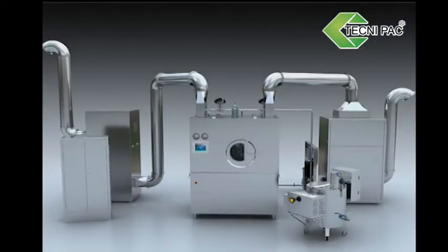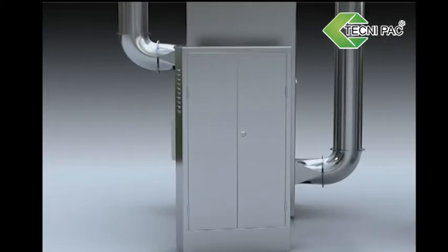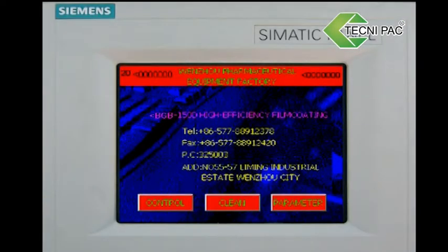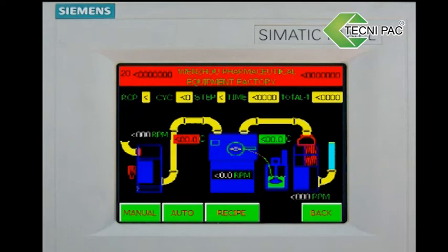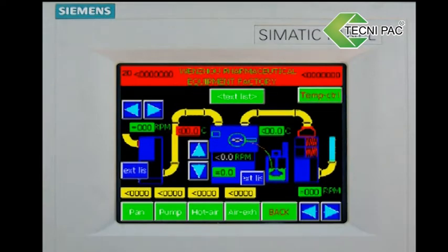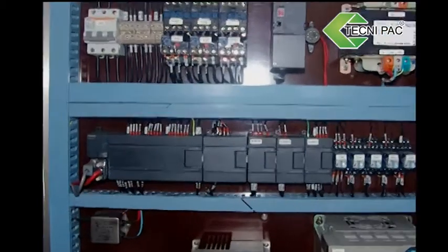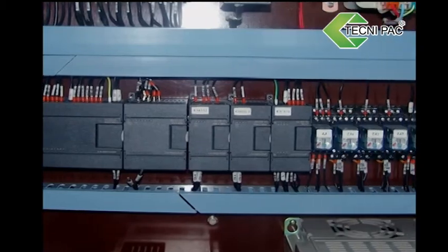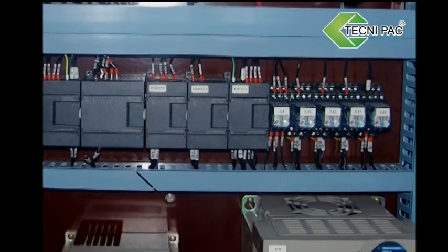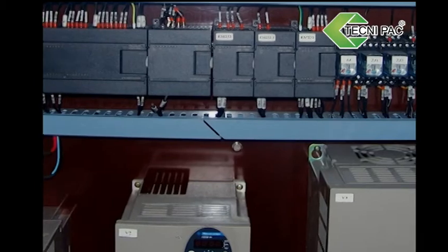Electric Cabinets and Programmable Controller Control System. Includes Siemens 6 color touch screen. All electric components including PLC, extended module, relative low pressure electric components, and inverter are all installed in electric cabinets, and all operation controlled by touch screen.